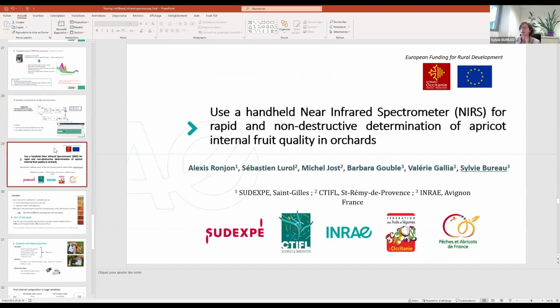Thank you, Audrey. So I will continue on a project we had in collaboration with an experimental and technical center in France. The objective of this project is to use a handheld NIR to determine non-destructively the apricot internal fruit quality directly in the orchard.